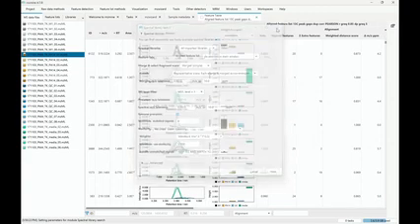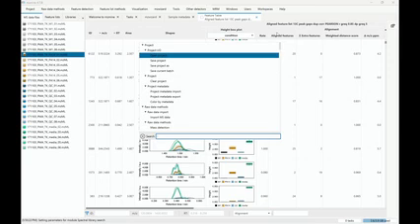So if you search again, and then again something like blank, we have two different methods that either go quite early in the chromatograms or later on the feature level. We do have some correction for retention time. We're currently also working on a new retention time correction.